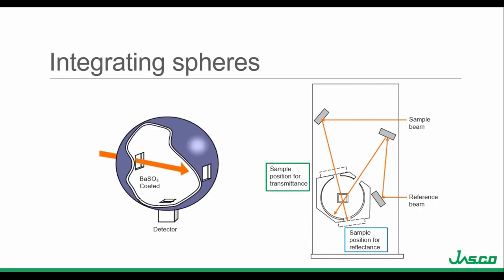In an integrating sphere, light diffusely transmitted or reflected by the sample undergoes multiple reflections so that the intensity becomes uniform, and some of this reflected light reaches the detector on the bottom of the sphere, shown on the figure on the left. Therefore, the average reflected or transmitted light introduced into the sphere can be obtained, resulting in accurate measurement.